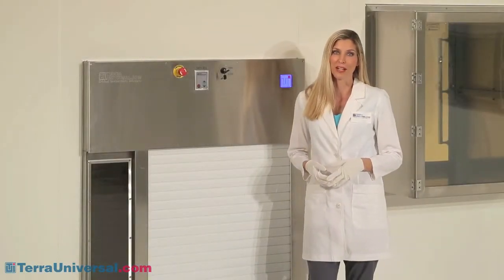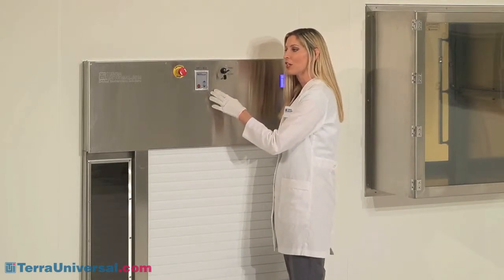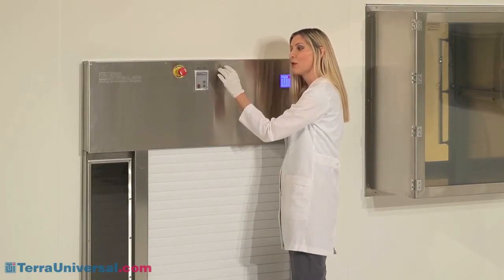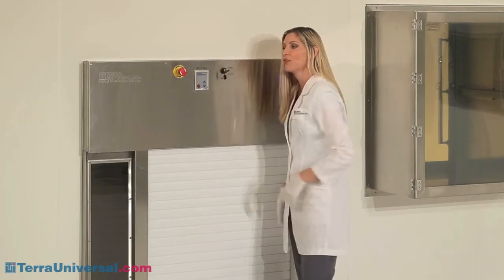The unit is simple to operate. A control panel located on each side of the chamber includes up-down switches, an emergency off button, and a key switch that puts the unit in maintenance mode, which bypasses the door interlock and allows both doors to open at the same time.